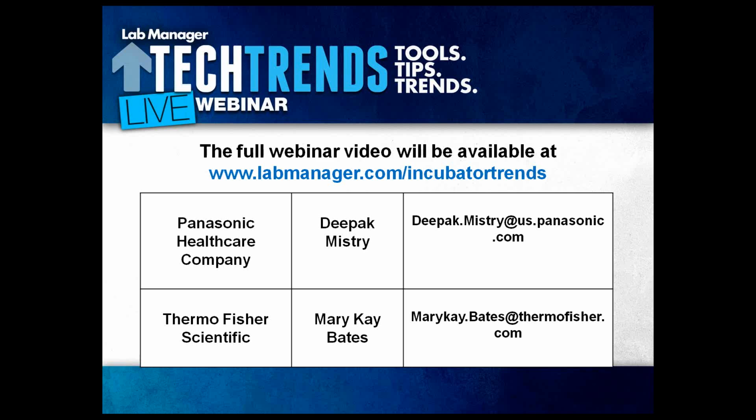Okay. Deepak, I think this goes back to the comment that you just made regarding the UV light. So the question is, for the UV, wouldn't it be dependent on the time of exposure? In this case, how long does the water in the pan need to be exposed to make sure that you're effective in killing all the microorganisms? It's a very good question.